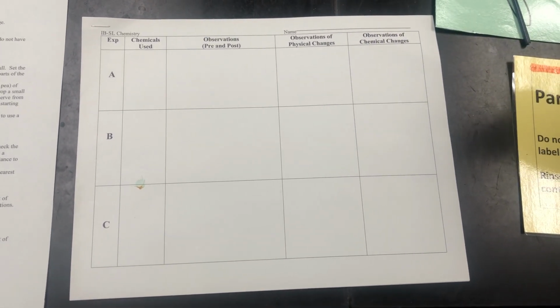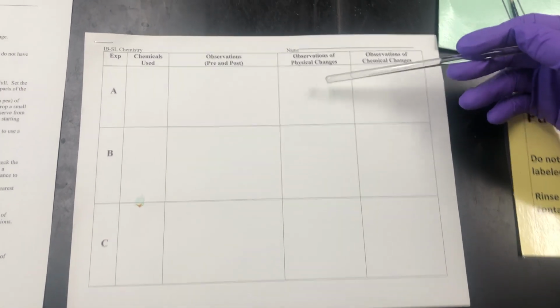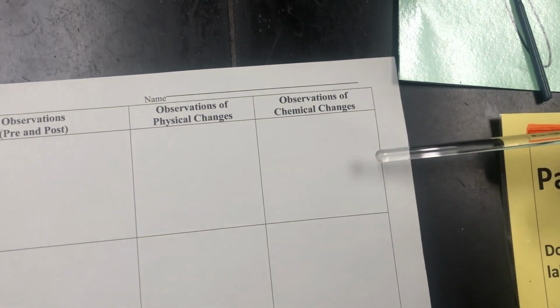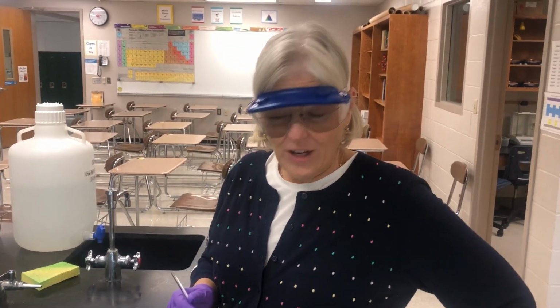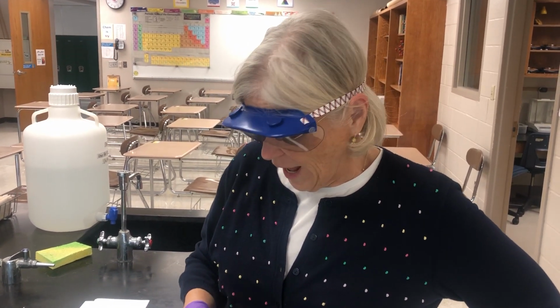See, I have to be careful because some of these will be chemical and some of these will be physical processes. If there are any physical changes, you write only the physical changes in this box and only the chemical changes in this box. You might not have anything written in every box, so beware of filling in these boxes very accurately. In fact, sometimes students want to redo this whole set of grids because they have changed their mind after they've done all the labs.